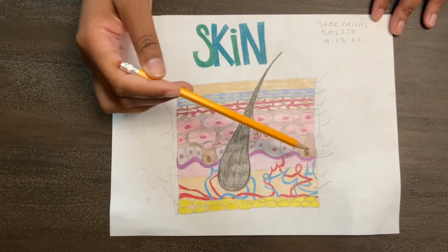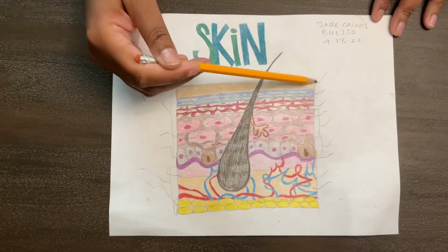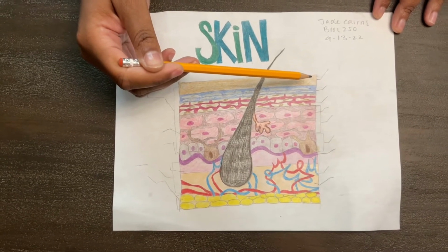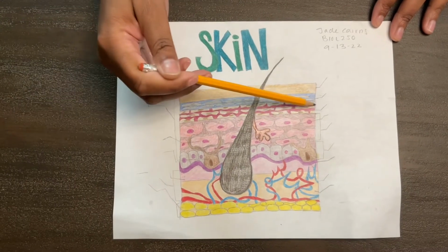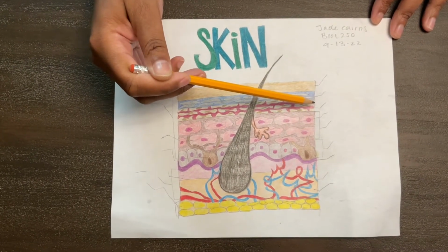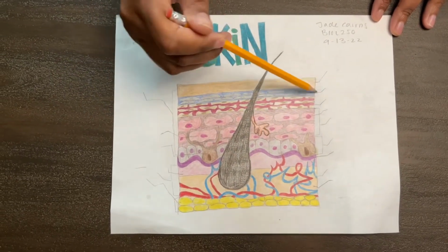The stratum corneum is this layer. The stratum granulosum is this layer. The stratum lucidum is this layer right here.